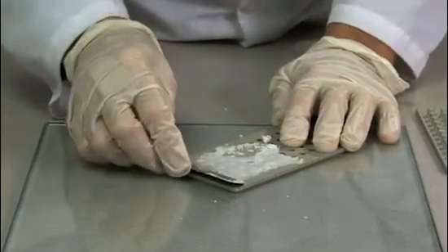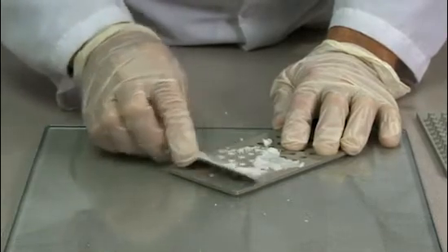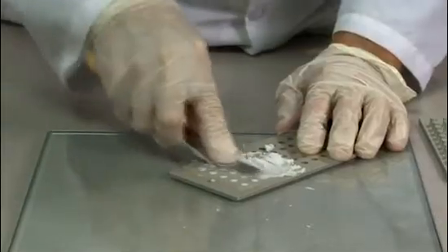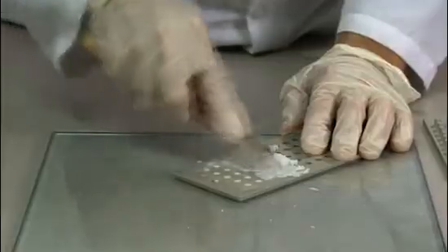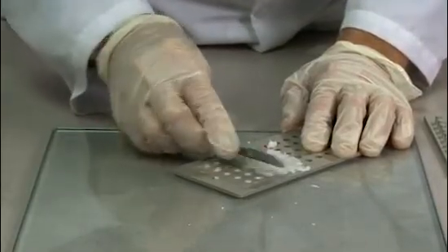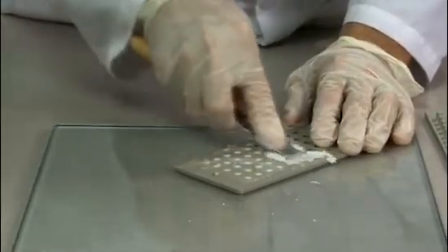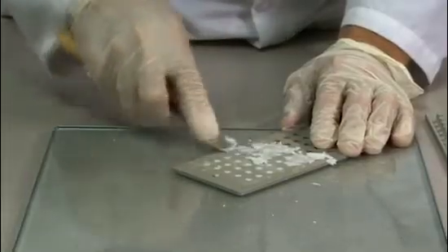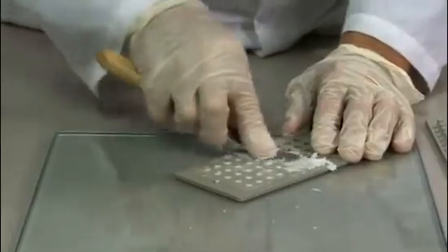Once you have completed 2 rows, scrape off the powder and continue to move down the mold to the next 2 rows, packing each of those tablets totally and firmly. Continue to move the material down the mold 2 rows at a time, and again, pack the tablets firmly and completely.